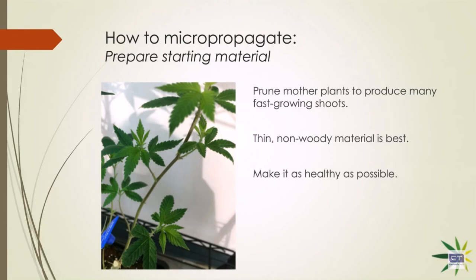All right, explain to us these steps and variations in the process and the sugar and the nutrients required. And really just, as you get these things cleaned and chopped, that coddling, what is that coddling? Well, there are many variations of this process, so I'll be a little bit general, but there is one universal requirement. Plants, any living organism, essentially, has to have sugar to live.